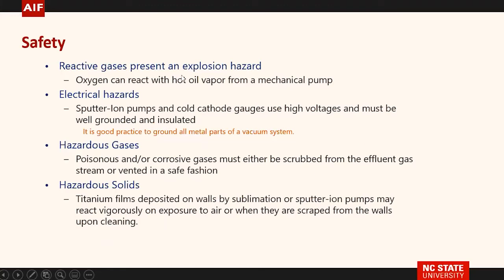Reactive gases: on at least one mass spectrometer I work with, if you press the wrong button, it would pump the oxygen cylinder that you're using for an oxygen source. This didn't happen to us, it happened to someone else though, and that oil with all the oxygen on it started a fire. What's your real hazard?